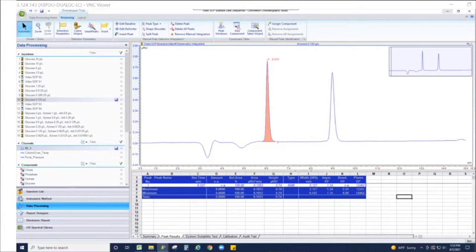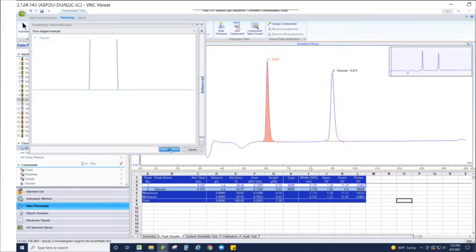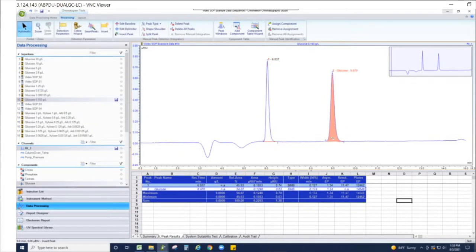You can then integrate unresolved peaks using Smart Peaks. Select Smart Peaks and then select the area in the chromatogram containing unresolved peaks. Finally, select the integration that is needed.